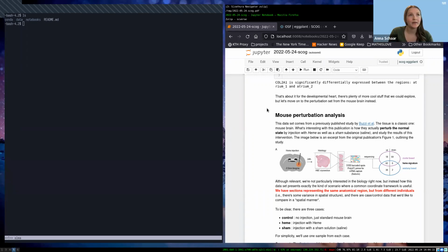Yes. The next question would be, for information transfer, is only one landmark considered, or can I use multiple landmarks together?